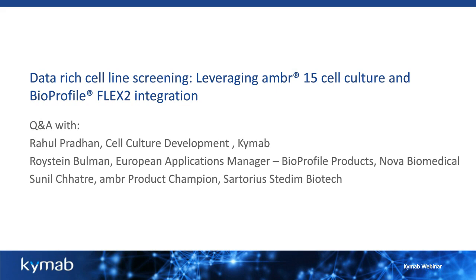I have a question here on product quality. Did you compare product quality in ambr versus the 3-liter and the 30-liter? Yeah, so I haven't shared that data with you guys, but yes, we did compare product quality between the different scales, and it was all found to be comparable.